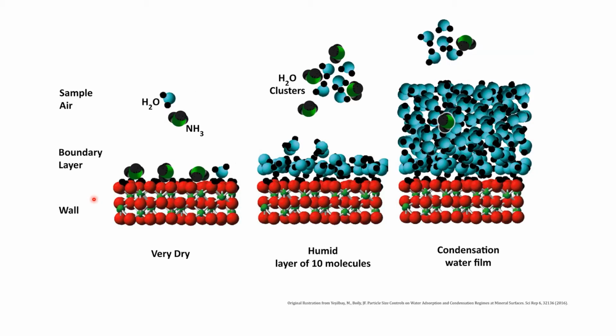Now with ammonia molecules, a similar thing happens as it is a polar molecule as well as humidity. If it's very dry, like with gas from a calibration bottle with, let's say, 100 ppm in nitrogen, some of the molecules will stick to the surface and so will not be measured. If the gas is changed to a normal humid mixture with some ammonia, the water molecules will replace the ammonia molecules on the surface, as the humidity molecules have a stronger bond than ammonia.